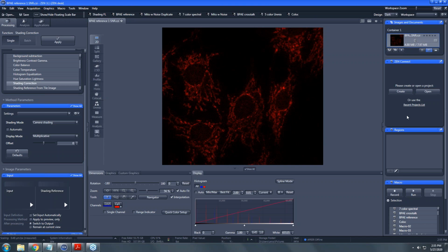And 2, the more important answer is that the actual spectra that you get off of an experimental sample is not necessarily the same as what the published spectra is. And that's because of the local conditions, local chemical conditions of your sample. So it could be that it's smack on, but it could also be that you're off by a significant amount. I'm going to say multiple nanometers on the peak or the shape of the curve because of the pH, local redox environment, whatever that may be.